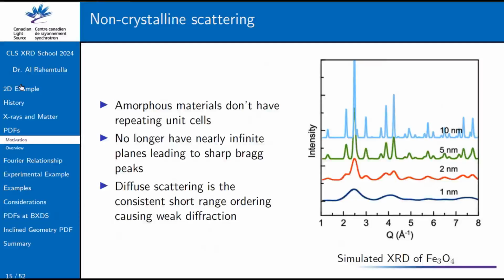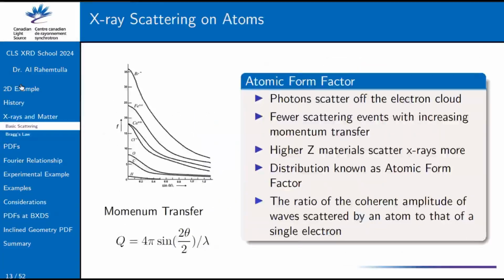There's also one other subtlety I want to add, which is that because of the background subtraction you need to do, the worst thing that can happen is ending up with 0 counts. That means you're missing signal, because your signal should be falling off with the atomic form factor, so there should still be a little bit of counts there. So you need to count enough to get some signal there. On lab setups, you have a variable count time, so you probably count to signal, so you're not wasting a ton of time up here. But you need to make sure that even after your background subtraction, you are still left with something over here that still normalizes. If it falls off, then you're not going to be able to use that.